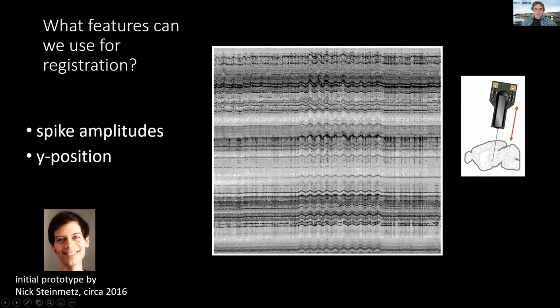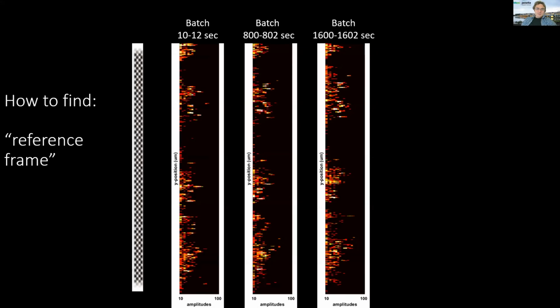our goal with drift correction was to make it look like there's straight lines to this plot, right? So to correct the data directly up and down, literally the raw data, we're going to correct it up and down after detecting how much movement there is at any one particular moment. The details of how we detect that movement, I'm going to skip over.